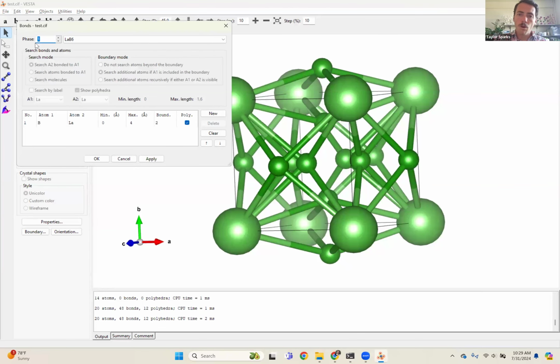So we're going to say more about this next time. We're pretty much out of time on this. So next class, here's what we're going to cover. We are going to show you additional things to use in VESTA. We're going to show you more things that it's capable of doing. We started out in class today showing you that it can generate X-ray patterns, for example. So what else can it do?